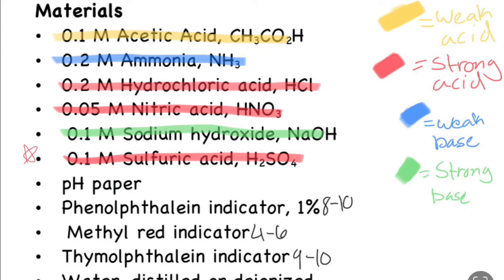In this picture, I have highlighted both the weak and strong acids and bases. Knowing this will help determine which to use in your titration curve. I have also put around what pH the indicators will begin to react.